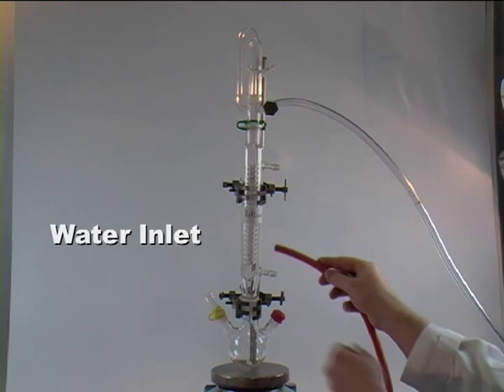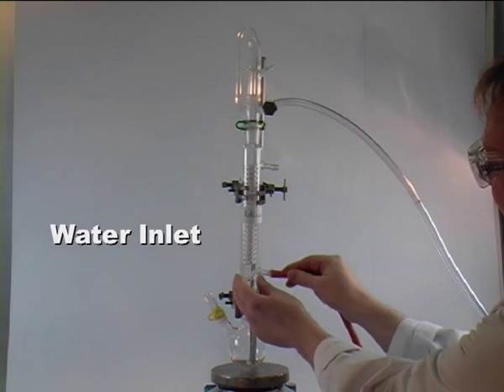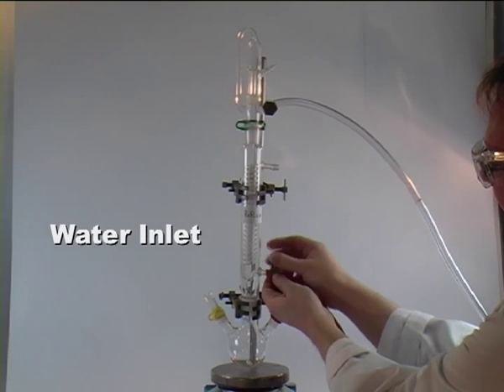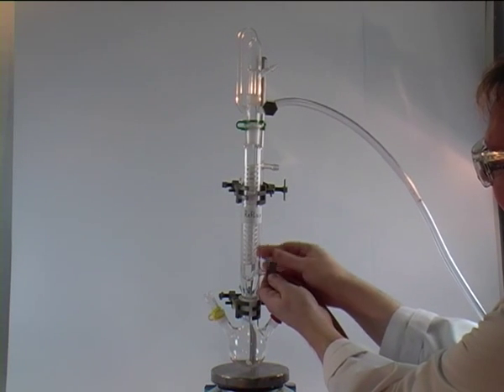Next step is the water inlet to the reflux condenser. Remember that the bottom one is the inlet. Again, we connect it to the line and secure it with a jubilee clip.